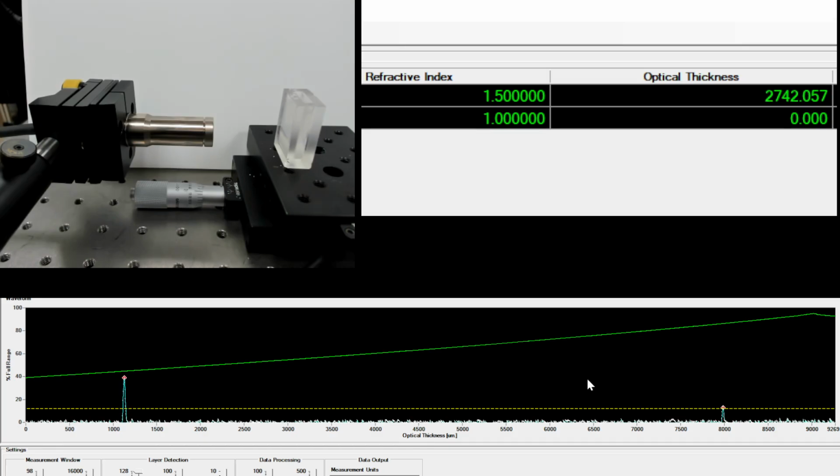Okay, it might take longer than I want for this video, but that's what editing's for. I'll sit here for a second, see if it can catch up. See, the problem is I can't read the optical thickness with any sort of confidence in the accuracy until it settles, because I think it's averaging right now. Yeah, it's averaging 10 measurements.